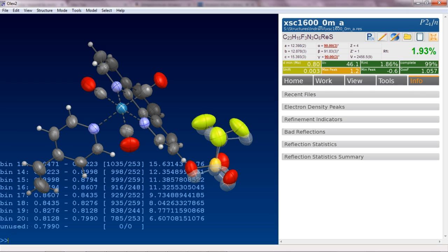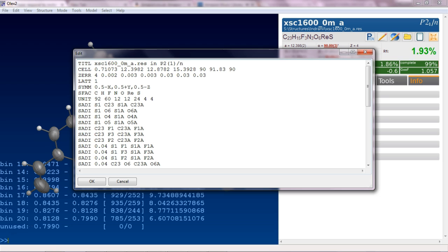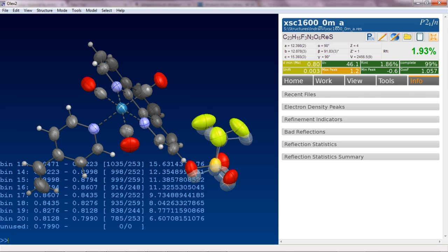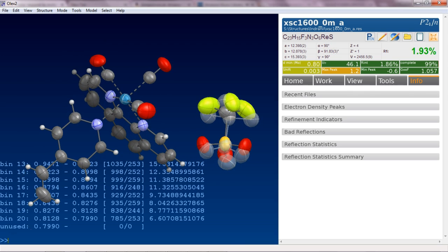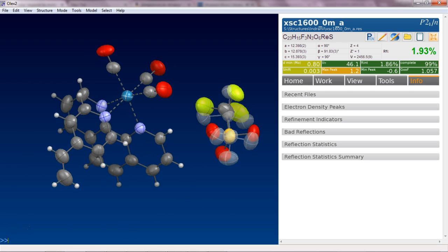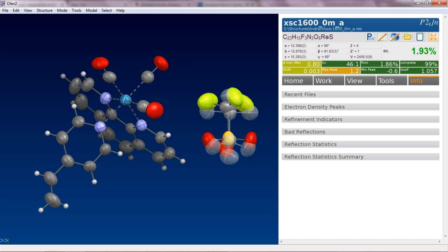Now, I don't know where this comes from. But let's just fix this manually. So we go up here, for some reason, 90 degrees have an ESD with them, and they shouldn't. So we just make this a zero here, and a zero here, and that should deal with that. And I would say this is a nicely finished structure, I wouldn't go any further with that. Biggest Q peak, let's check where this is. Switch to Q peaks on with Ctrl Q, click on that. And that's not close to the metal. So that's kind of to be expected that there is a peak there. I think that is about all I can say about the structure. Thanks for using Olex too.